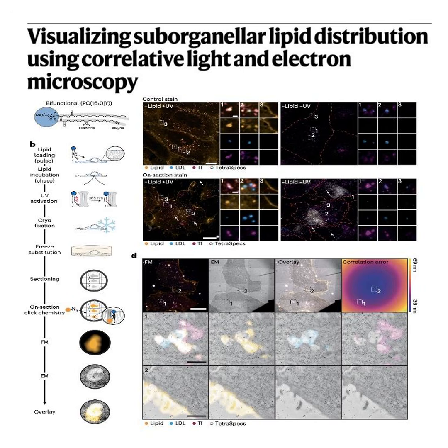Next, we hit C, which is crosslink. They use UV photocrosslinking to permanently freeze the lipid to its neighboring proteins. But wait, reading through the source material, there was a glaring physical contradiction here. Oh, the sapphire discs. Yeah, the cells are cultured on carbon-coated sapphire discs, and carbon famously absorbs UV light. So if the disc is absorbing the UV from below, wouldn't that completely ruin the cross-linking efficiency? It was a massive physical roadblock. Yeah. Standard bottom-up UV illumination was hitting the carbon and just failing completely. So the researchers engineered a physical workaround.